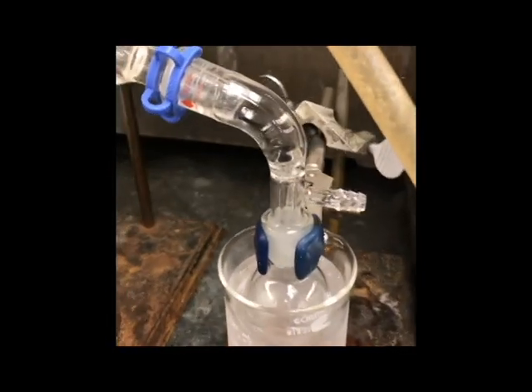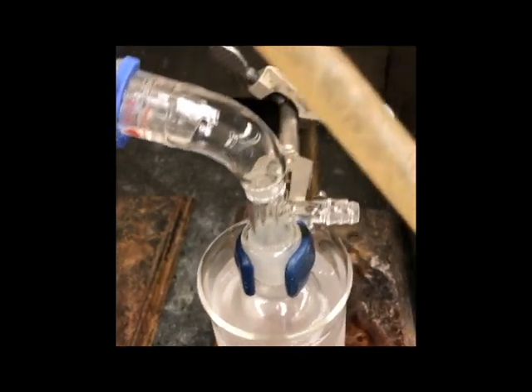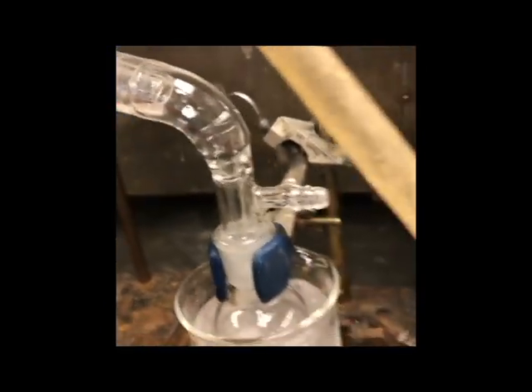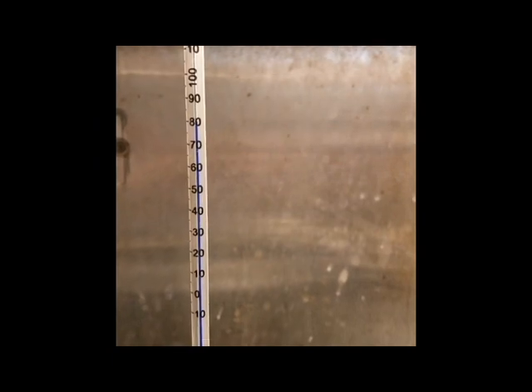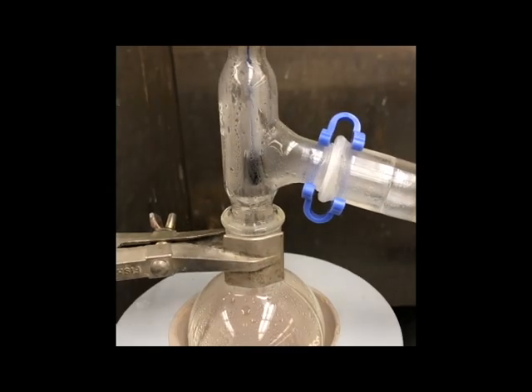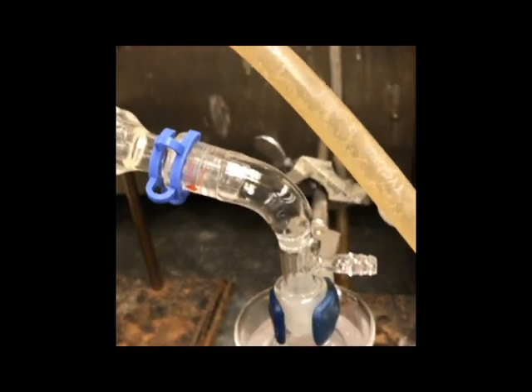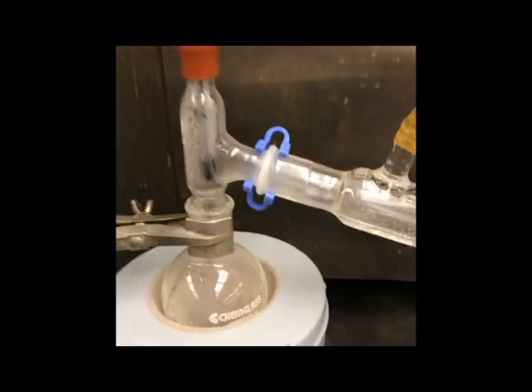Okay, so we just got our first drops coming through. I know it's hard to see through the video, it's even hard to really see in person, but we are getting some condensation up in here. So our temperature right now is just approaching 80. We went about to 90 or so, but then we took it off the heat because we didn't want it to get too hot. So I'd say the first recording for temperature would be about 85 degrees for the first drop. And now we're gonna let it sit here and cook for a while, and we'll come back to you guys after we get the rest of the stuff to evaporate.